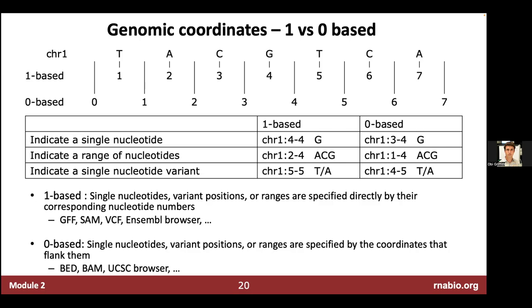So there's some advantages to it. For example, if you think about insertions, like I'm going to insert a bunch of bases, somehow that is more intuitive, that there's the position here indicated by a single number, two, where the inserted bases are going.